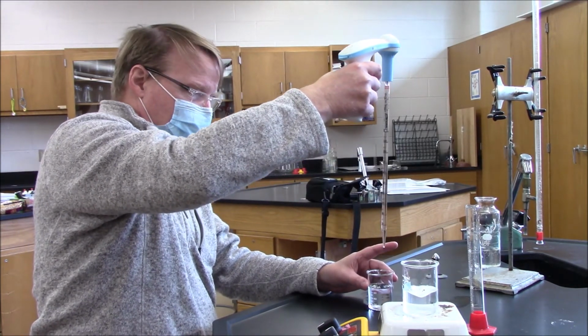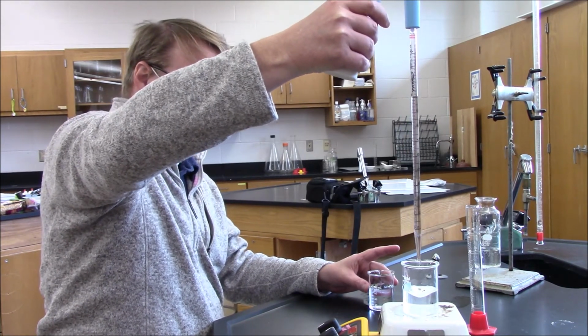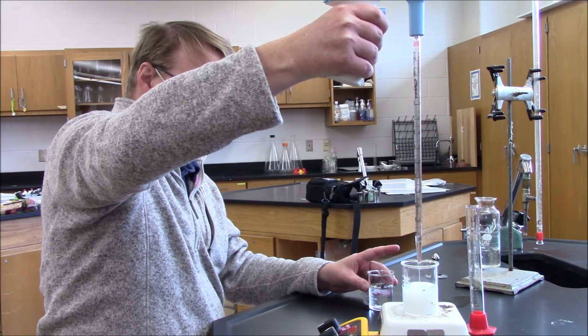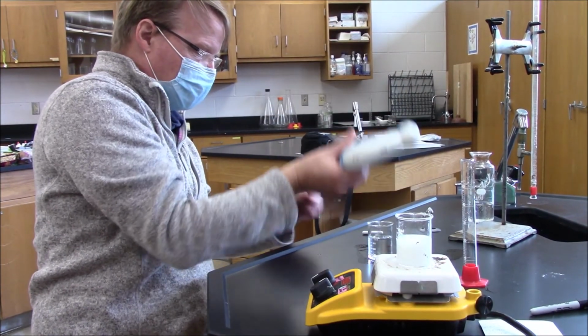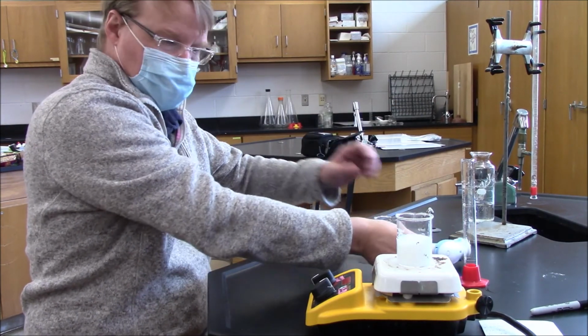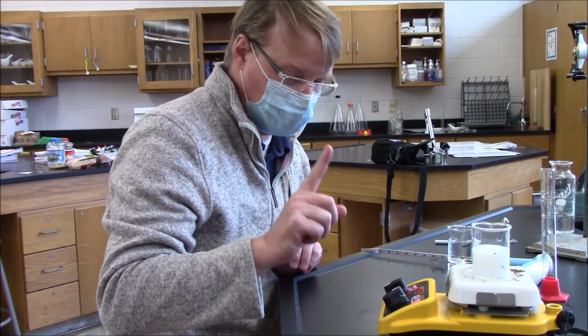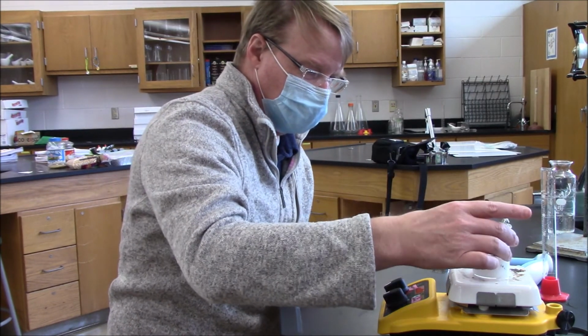And then what am I doing? You're going to empty it into the beaker on the hot plate. Just all out. That's it. Can't mess it up. Oh, that's cool. It's changing. So what we just did was we made a precipitate out of all the calcium ions that are in there. So now you can turn the stir bar off, and you can pick up the beaker and we're going to carry it over here.